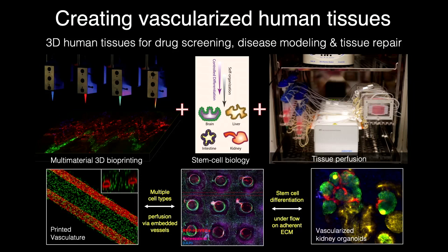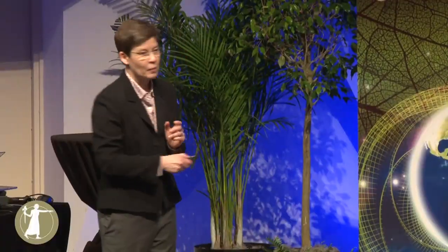But I'll walk you through a progression that we made in our own lab over the last 6 years, starting with just bioprinting, because it can do some things, and then how do we combine that with stem cell biology to do maybe something much more.